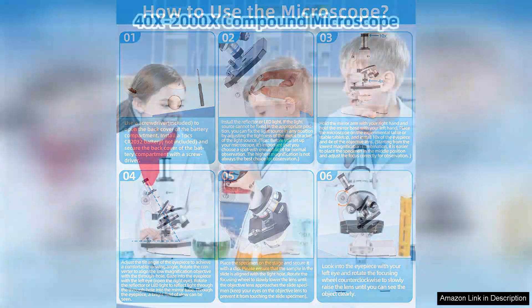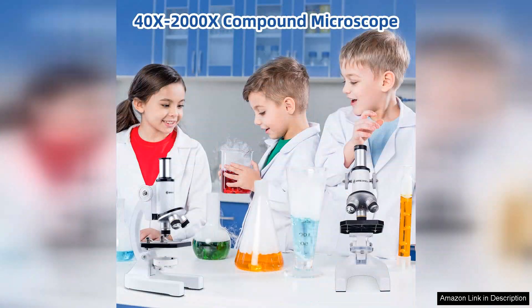In summary, the microscope for kids is an excellent educational tool that combines quality, functionality, and fun. It encourages curiosity and scientific exploration in a user-friendly format. With its reasonable price point and thoughtful accessories, this microscope kit is an ideal gift for budding scientists. Whether for school projects or at-home exploration, it opens a window into the microscopic world and fosters a lifelong love for science. Highly recommended.